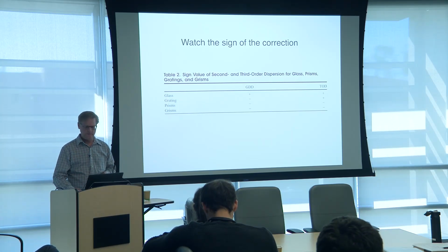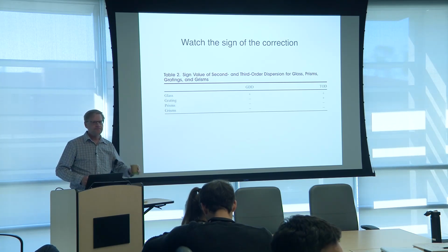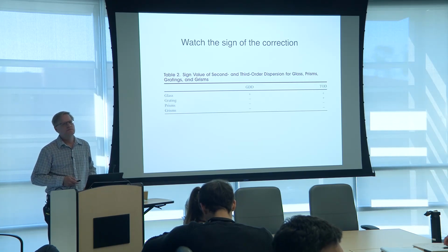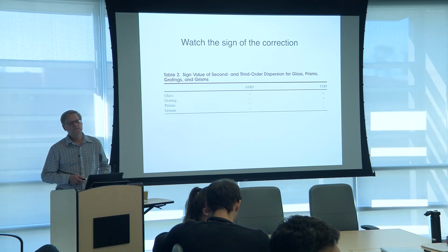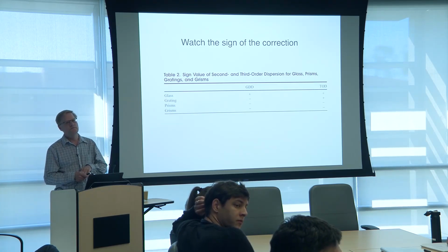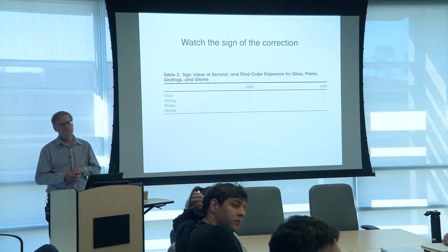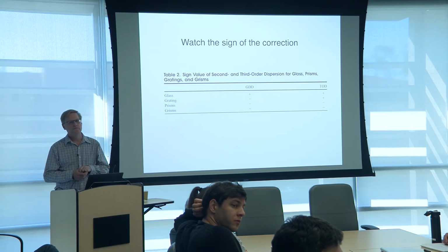Okay. Just to elaborate on what you just said, the single prism pre-comps that I showed you downstairs, we had originally made them with SF11, which is a pretty commonly available glass, but it's not super dispersive, so we weren't getting quite as much compensation as we wanted. Swamp Optics made us custom prisms out of PBH71, which is this heavily leaded glass, a little bit harder to get, but it gave us much greater GDD compensation. But it also has massive third order, and that could have killed us. It turned out just in practice that it didn't. But this is something that you can model.